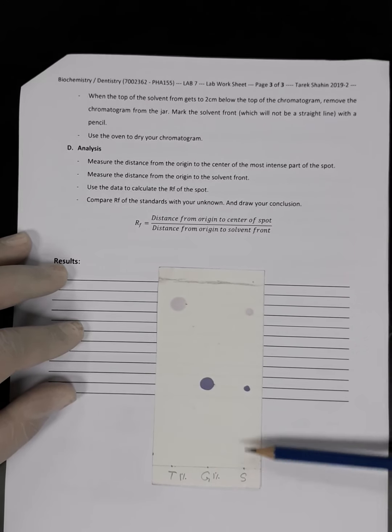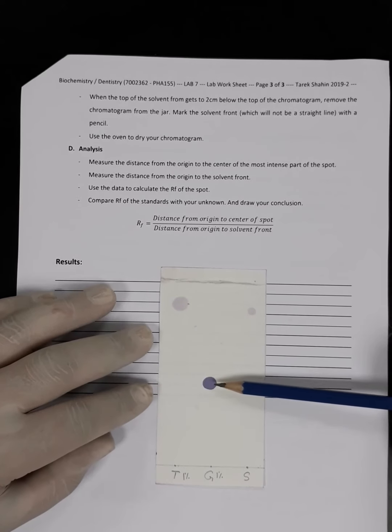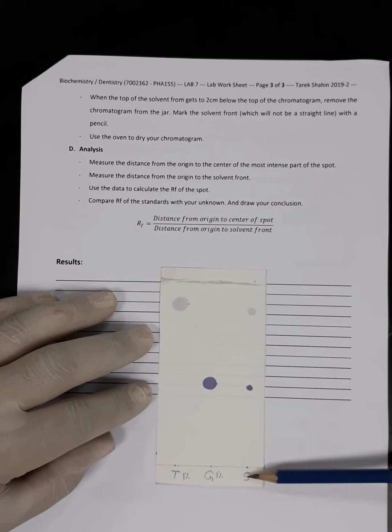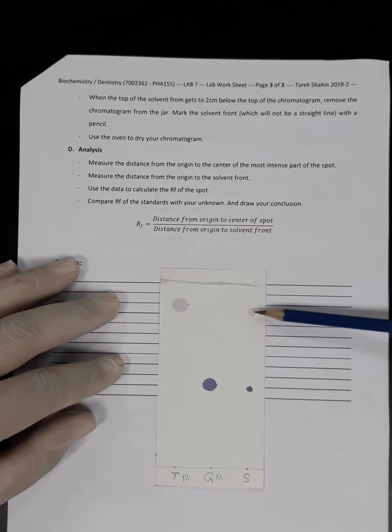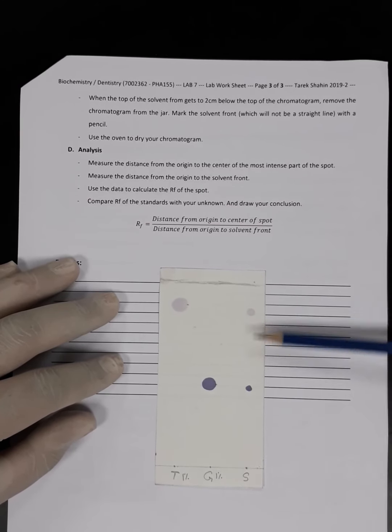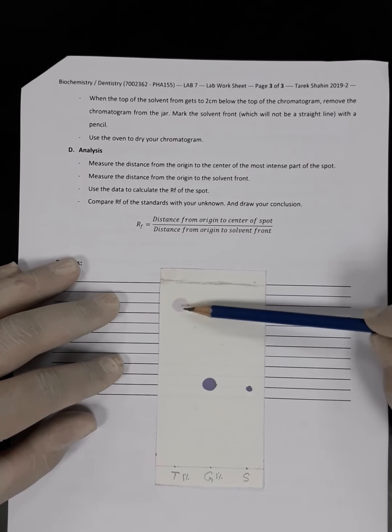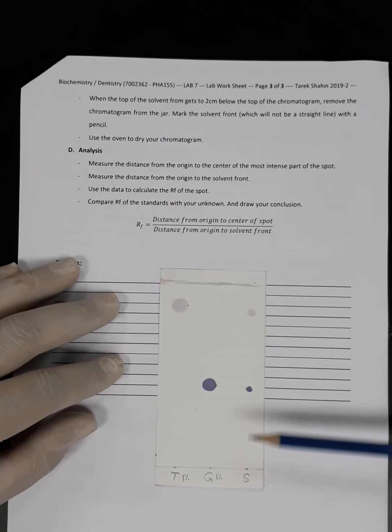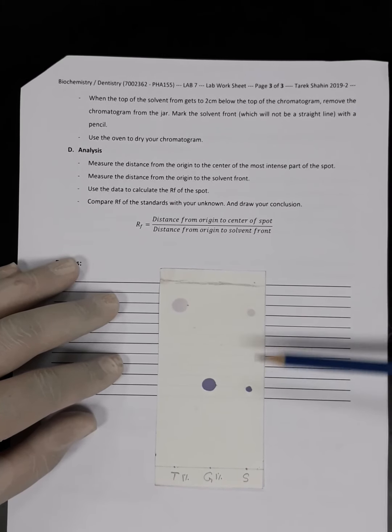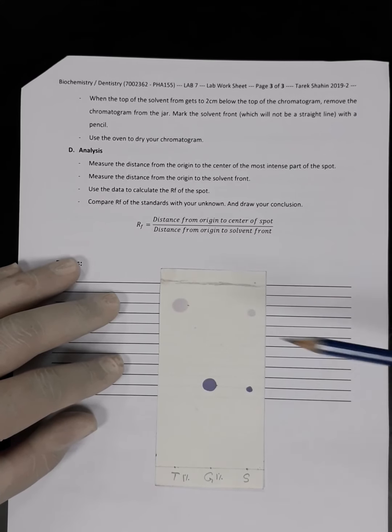Okay, so for the sample we found here 1 spot and another spot. If we look at this spot, we will find it almost parallel to this spot. So we will say that the sample contains glycine. And the same for this spot, which resulted from the sample. It's parallel to this spot, so we will say that the sample contains tyrosine. So the sample contains both glycine and tyrosine. So this is the qualitative analysis of the chromatogram.